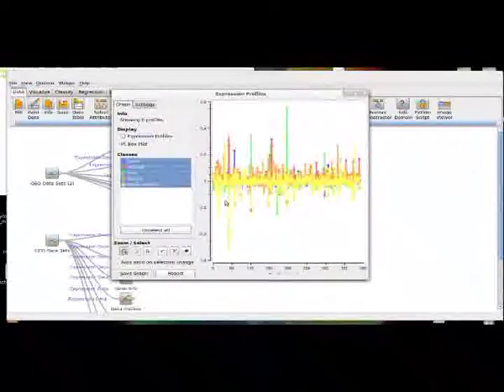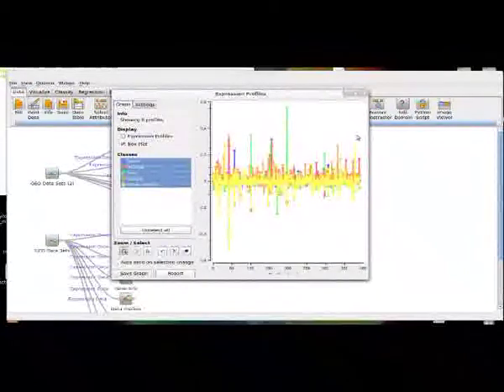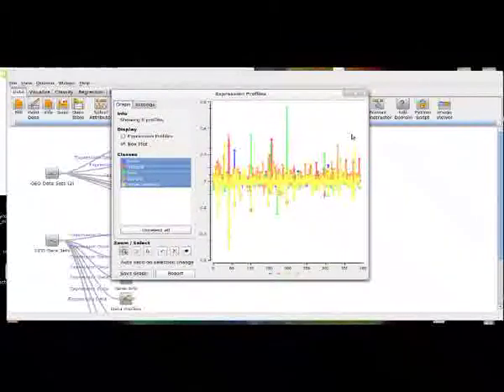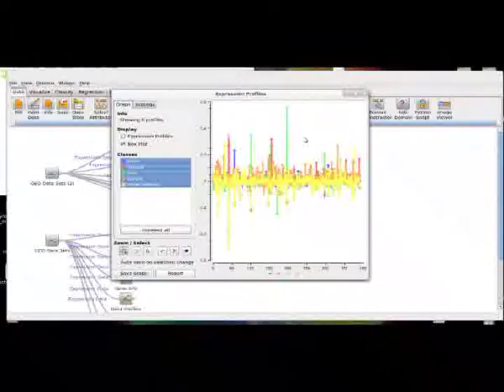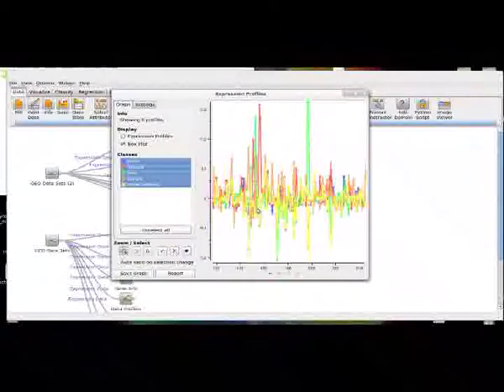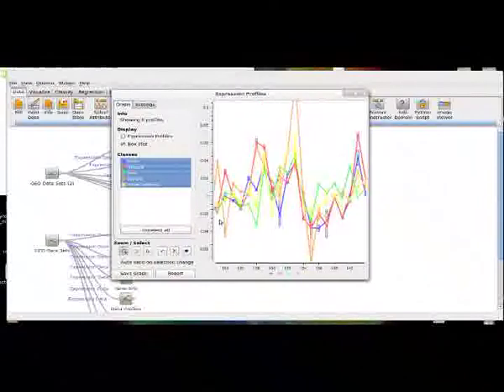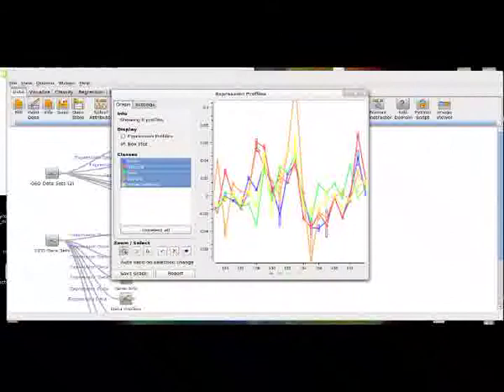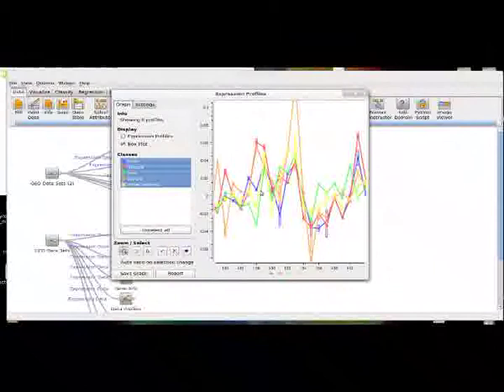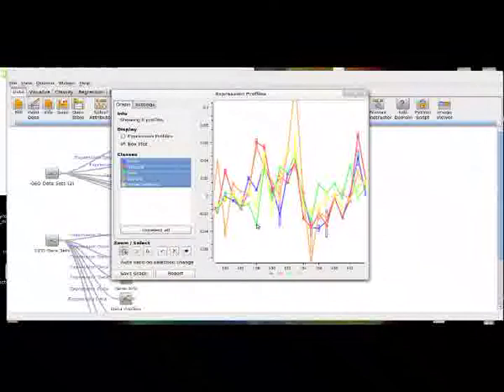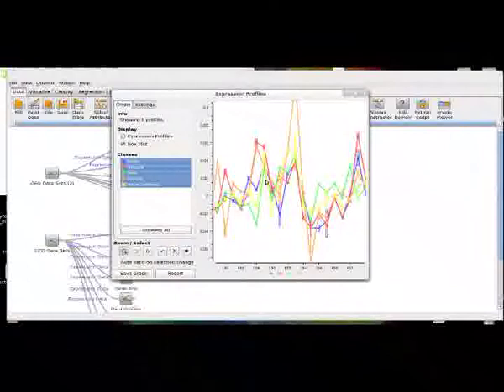I reloaded Orange, transposed the data, and now we're live again. So this is looking at each individual gene's expression profile, and we can look at some sort of subset of this data. Each one of these little differently colored lines is going to be the expression level of a gene, or of one of the samples. And each up and down, each actual point that this line hits is the expression level of a particular gene.